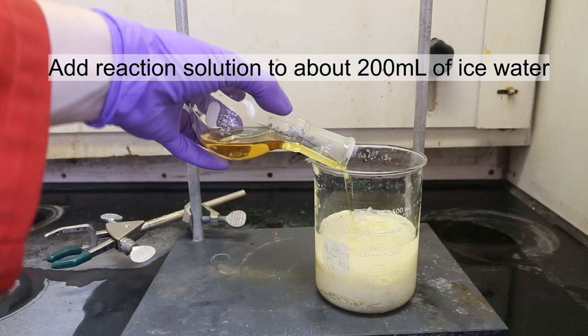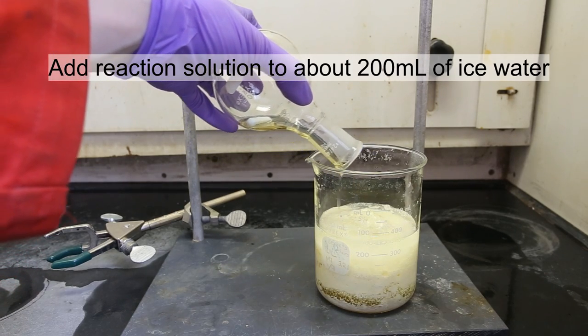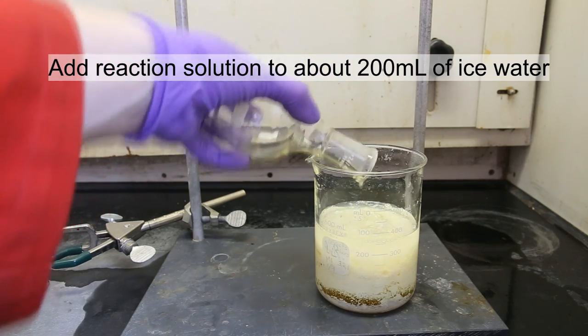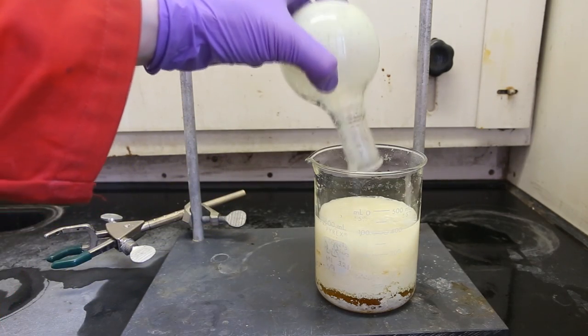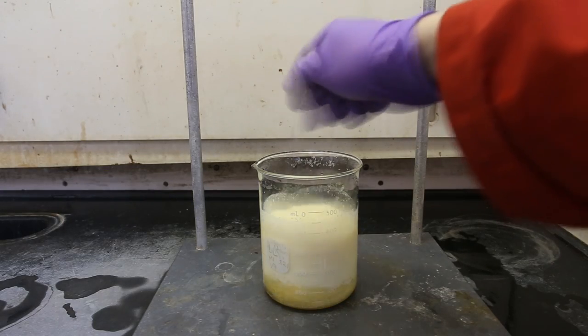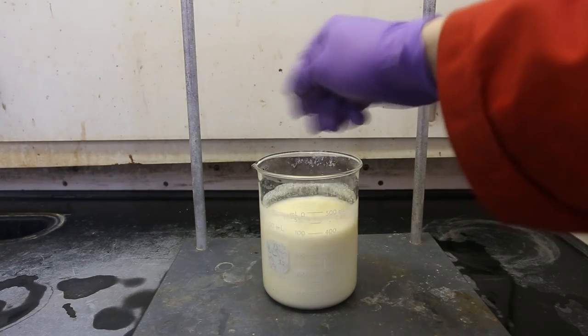The yellow color of the precipitate is actually ortho-nitroacetanilide. The p-nitroacetanilide is white or colorless, whereas the o-nitroacetanilide has a yellow color to it. Rinse the reaction flask with about 50 milliliters of cold water and add it to the beaker. Next, mix the precipitation mixture thoroughly, making sure that all of the sulfuric acid is dissolved in the water.